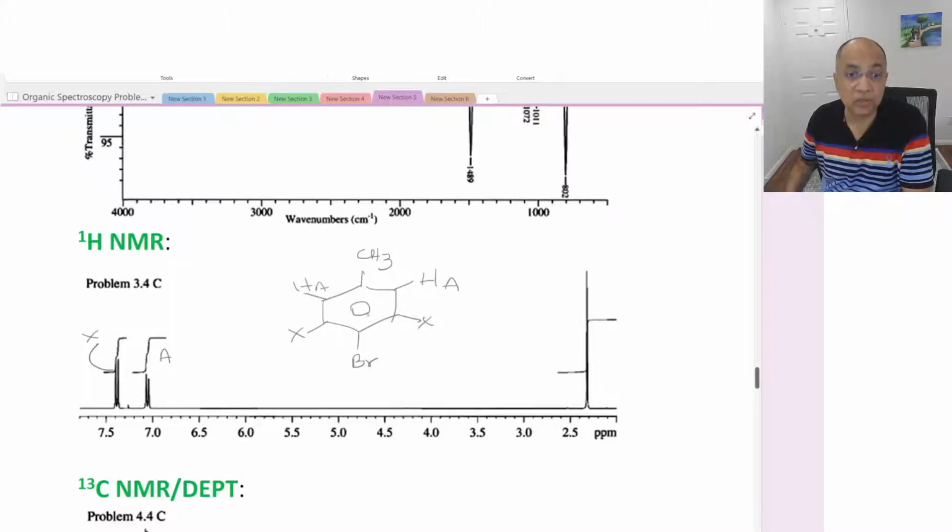We will not discuss in detail. This will not be an A2X2 system. It is an AA'XX' system because the two are not magnetically equivalent, although they are shift equivalent. Such a spectrum, an AA'XX' system, is really a non-first-order spectrum. Often we get non-first-order nature, but we are ignoring those little peaks on the sides, and we are not taking the expansion. We are viewing it from a distance without entering into the complexity of the pattern. We are looking at an apparent doublet for each.